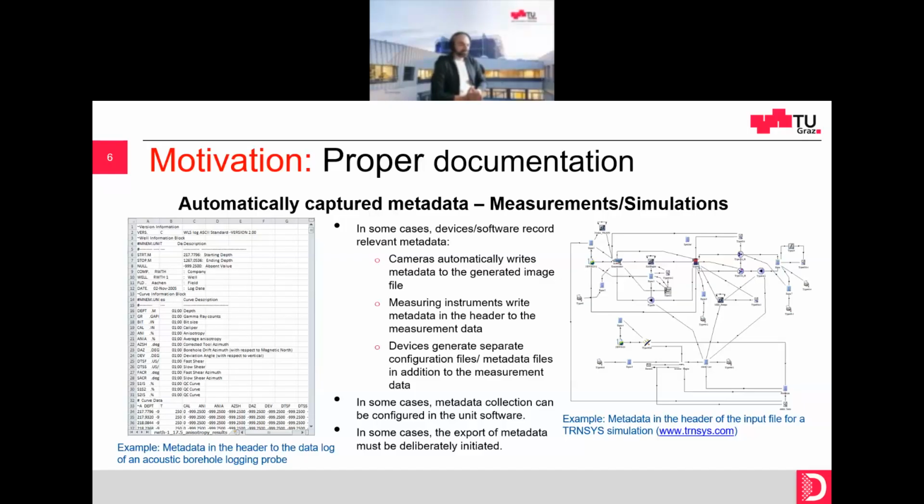And it is always a good idea to have these simulations, this measurement information, all of this metadata stored in some kind of information hub, which enables you later to properly document and explain the actual data that came out of all of these efforts.